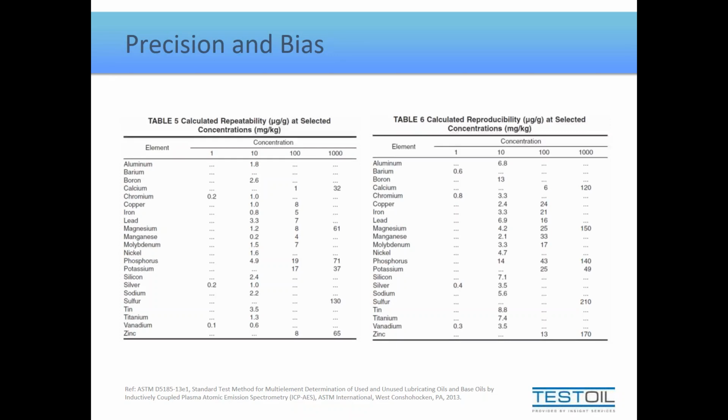So however you want to look at it, the big takeaway at this moment in time is that 1 or 2 parts per million generally is very insignificant. Unless the trend has always been low and it suddenly deviates higher, a 1 or 2 parts per million change from one sample to the next is usually insignificant.